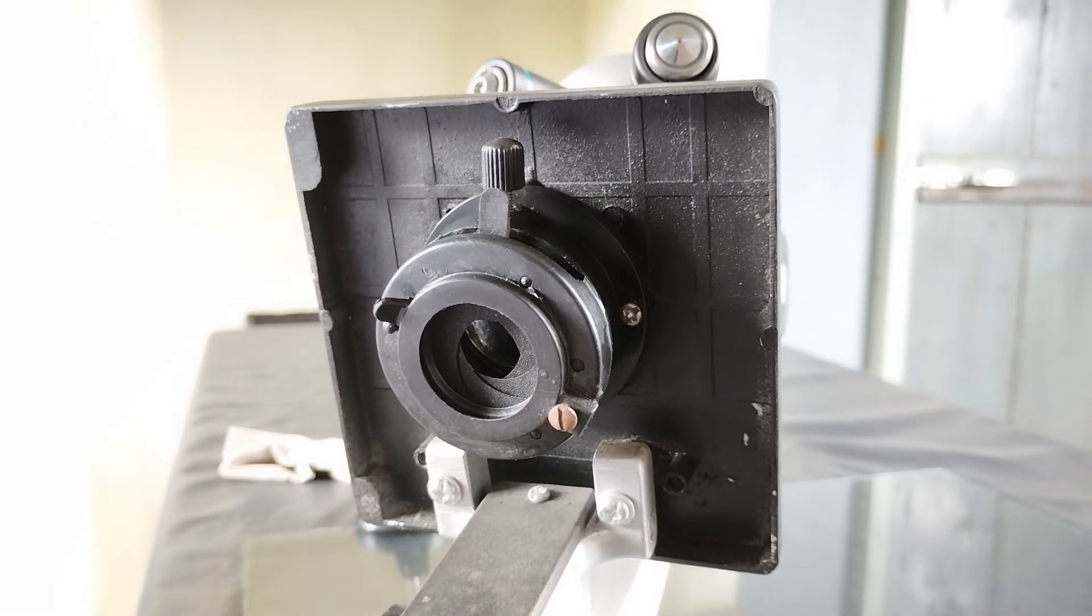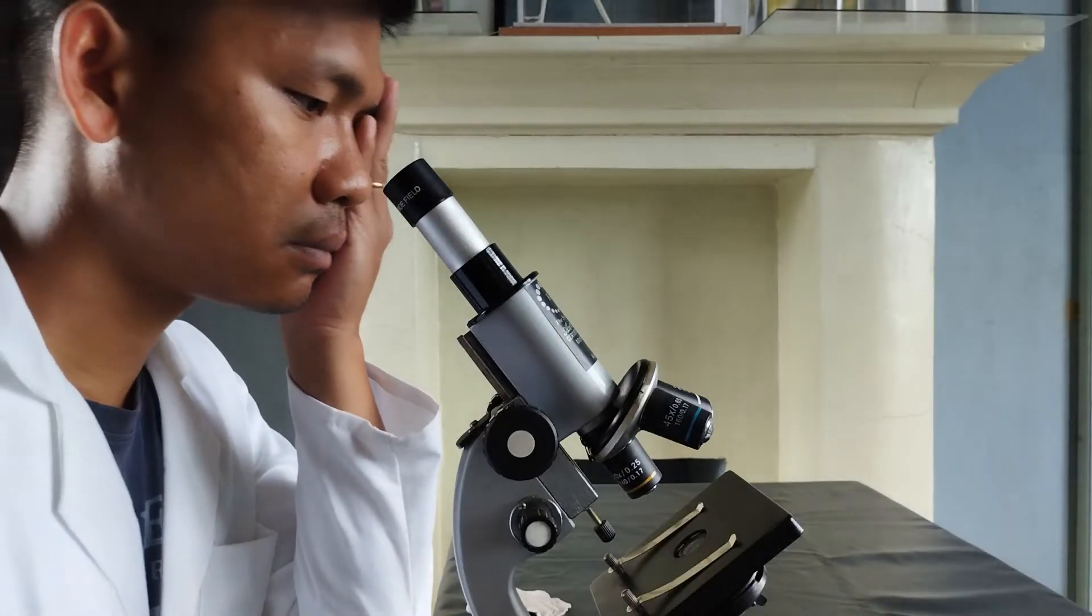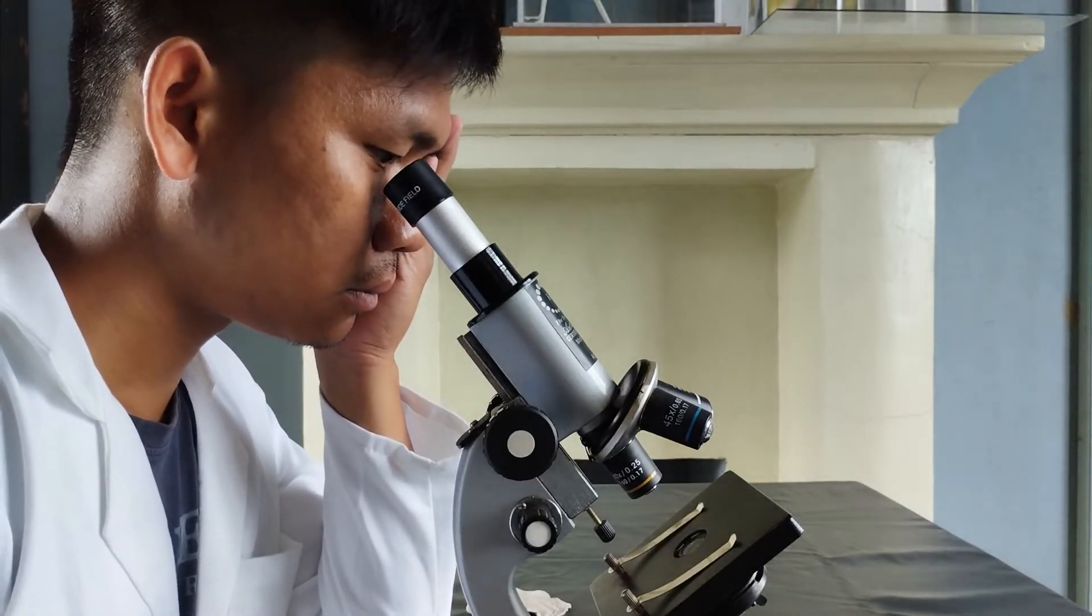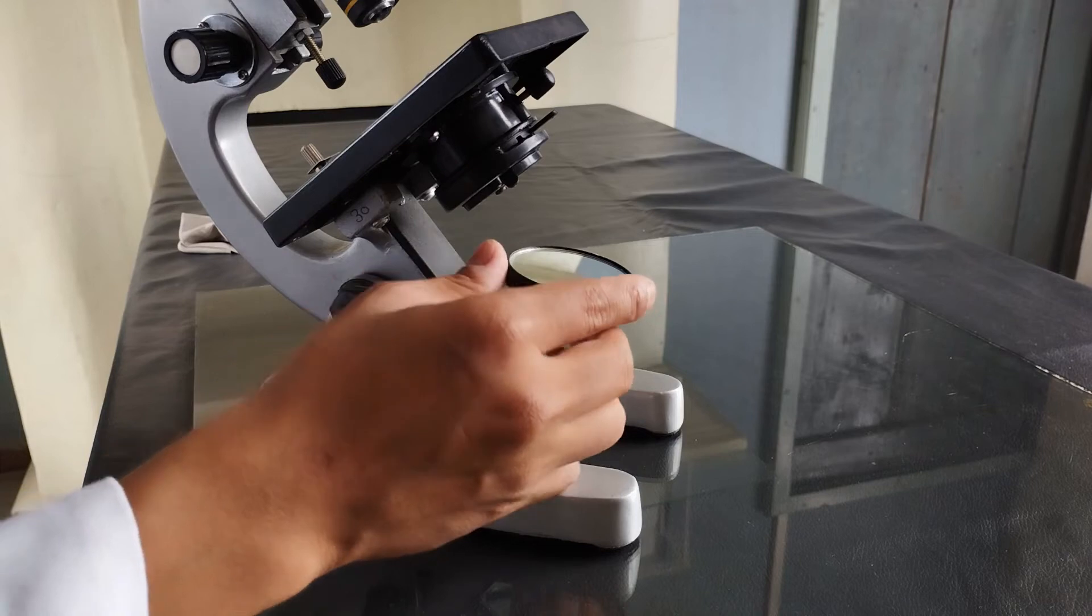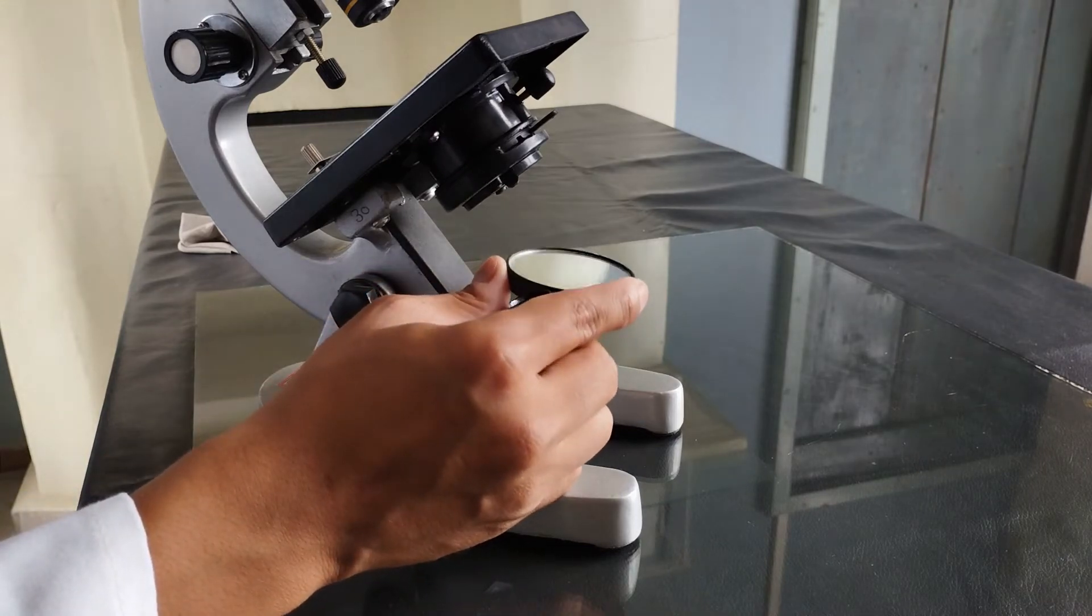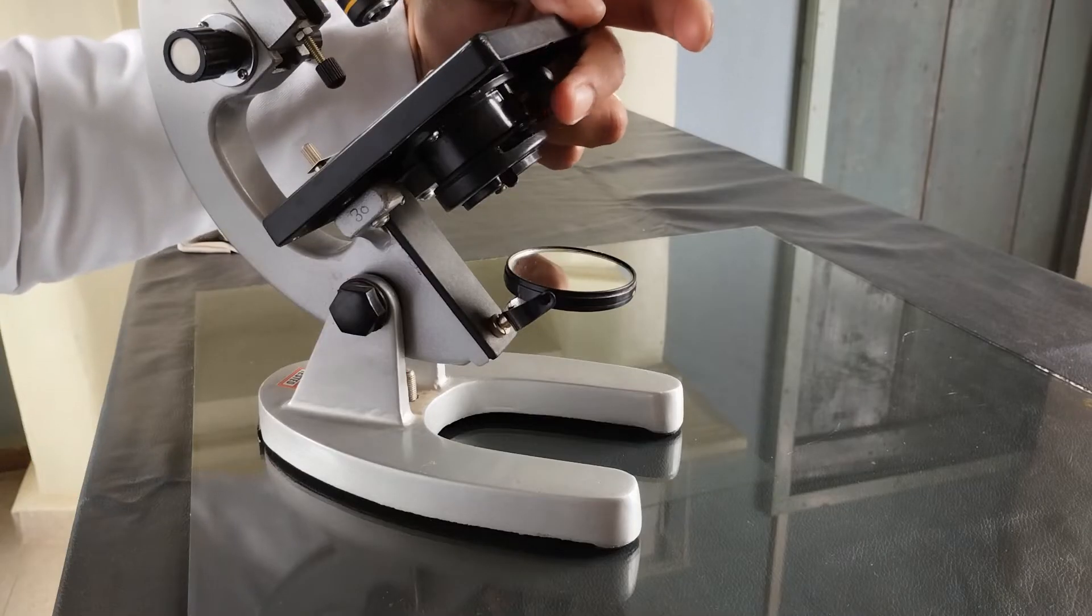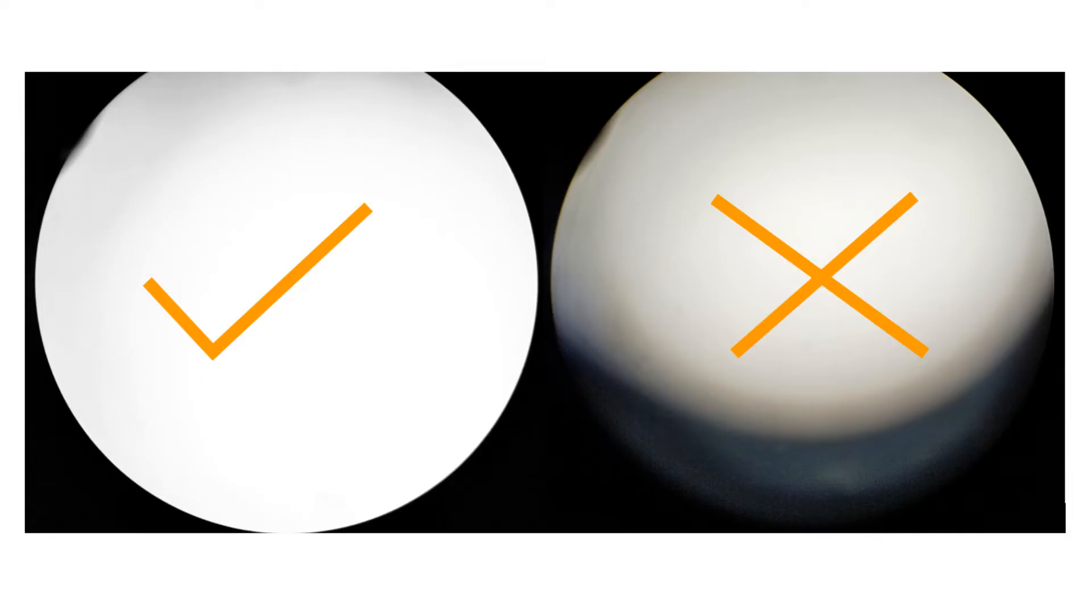Next, cover one eye with your hand, and with the other eye, look into the eyepiece. Then, adjust the mirror sideways and up and down, and also adjust the aperture of the iris diaphragm until the circular field of view is uniformly illuminated throughout, but not excessively bright.